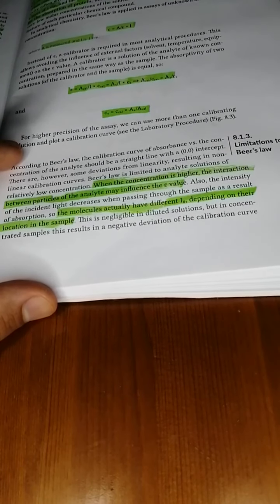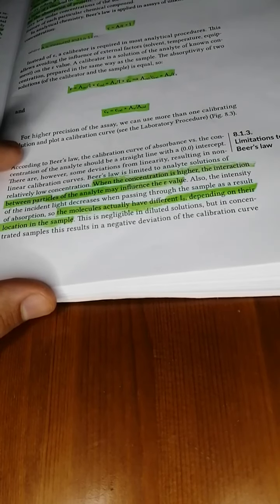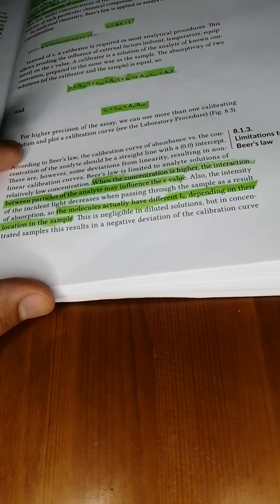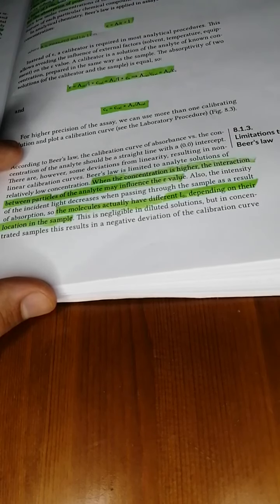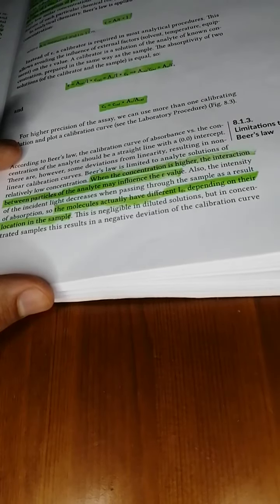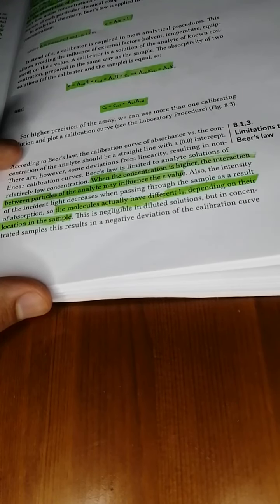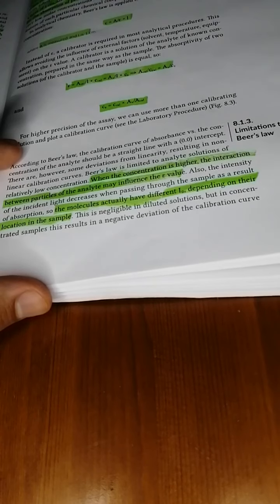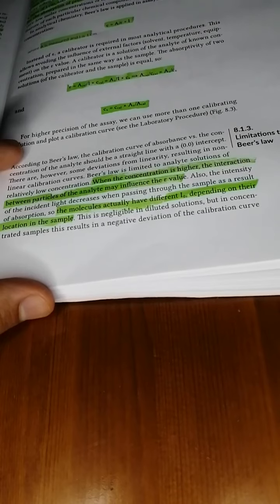You can only use it at lower concentrations, because at higher concentrations you get interactions between the particles of the sample. You have so many molecules in a very limited space that they're more likely to interact, and therefore interfere with the value for absorptivity, or even give you a false absorbance for a certain molecule.